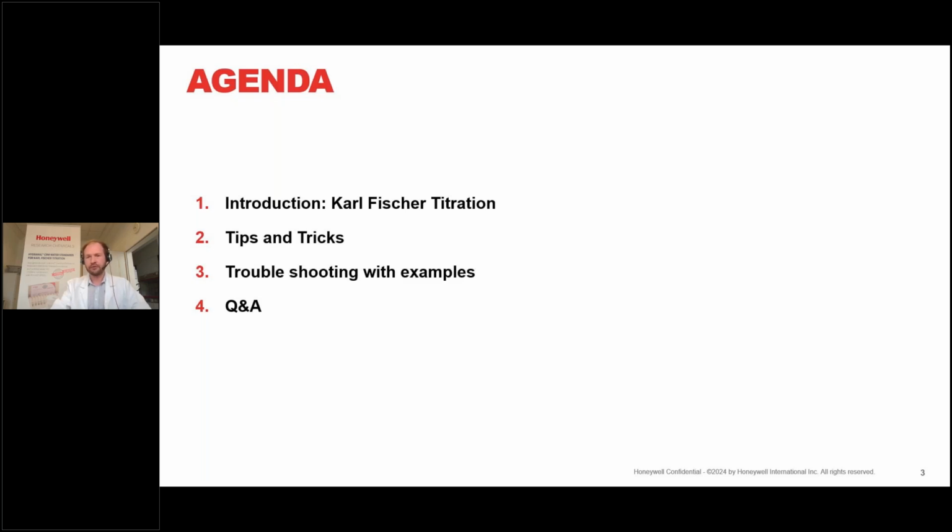I would like to start my presentation with a short introduction about Karl Fischer titration. And then I will give you some tips and tricks which may help you to get better titration performance. After that, I will continue with the troubleshooting, where I will highlight some potential errors across the industry sectors: pharma, food and beverage, petrochemical, and lithium battery industry. And finally, at the end of the presentation, you will have the opportunity to ask me some questions.